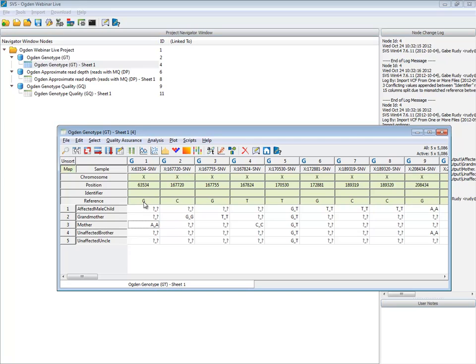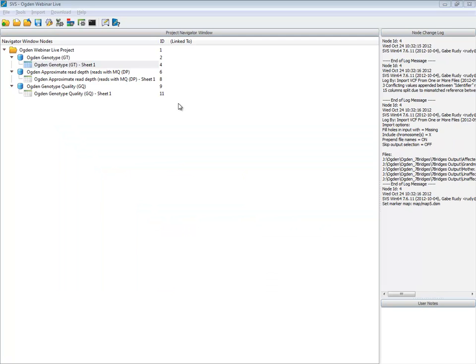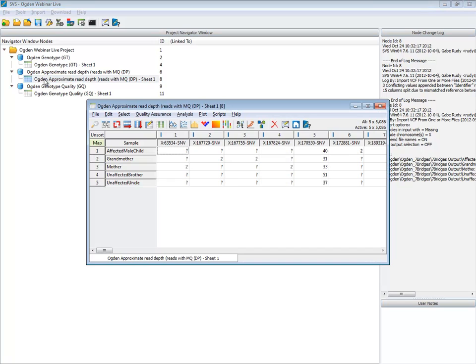We can see what the reference is by expanding our annotations. And I'm going to point out the details in those other 2 spreadsheets. So this is our genotypes. Notice again there's only one genotype per sample for these first couple of columns. And let's look at the read depth. Sure enough, for those same samples, the read depth is only 2. So these are examples of genotypes that we really want to drop before doing any more work.